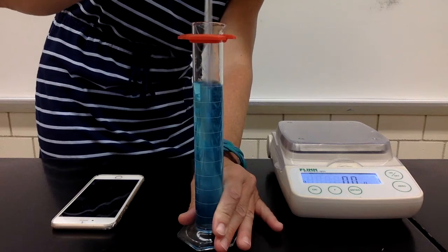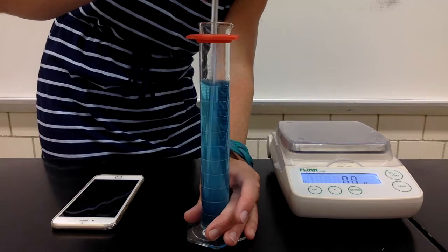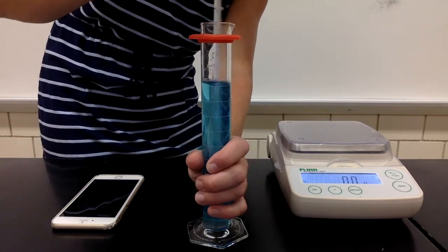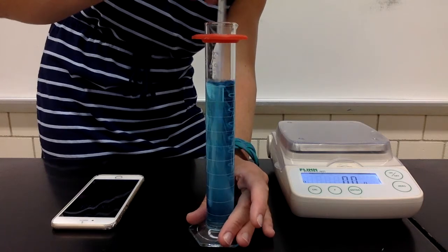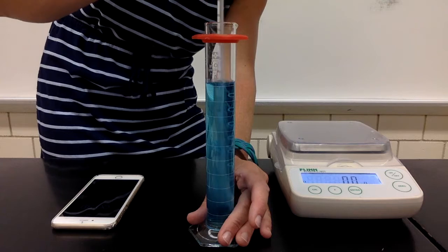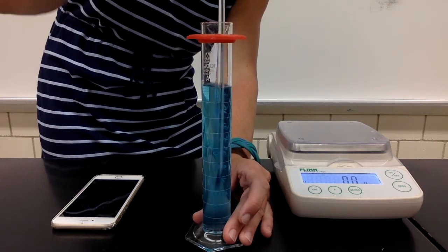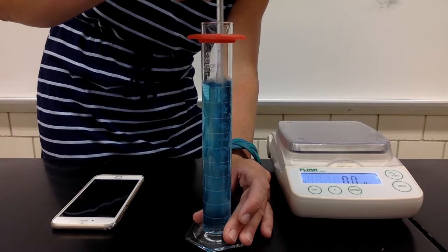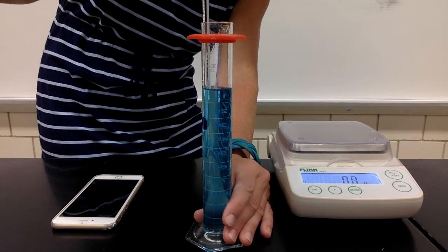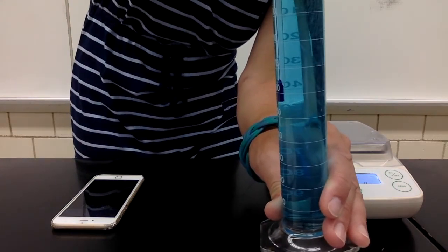The graduated cylinder feels a little bit warm. I'm not sure if that's from my hand or because there's some heat being released here. I'm trying to be careful not to splash anything. Look at all those bubbles in there, rising to the top.